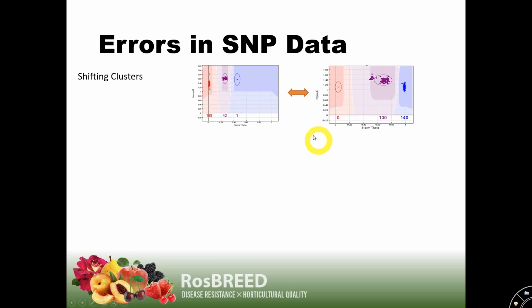So in the first case, you see here 2 SNPs. In the one on the left, all the intensities have been moved to the left. So if you can see here at the bottom is 1, so we would expect the BB cluster here, but it's not. It's almost in the middle of the plot. In this case, GenomeStudio still recognized the 3 clusters correctly.